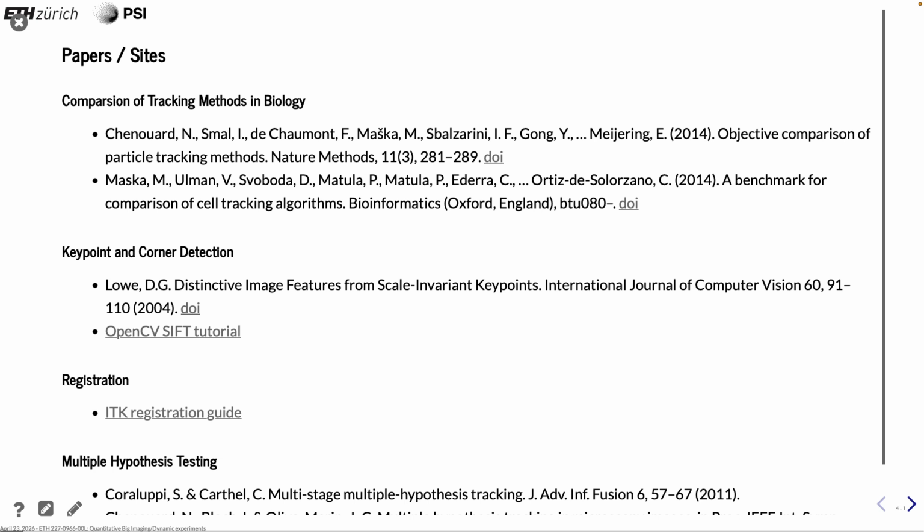So it's really photographic and imaging based data sets. And in the context of this project, they built up actually a whole library, and that has been ongoing since, I think, the 90s even, that they have developed on this. And in that, there is also this registration toolbox, which is one of the most used, I would say.